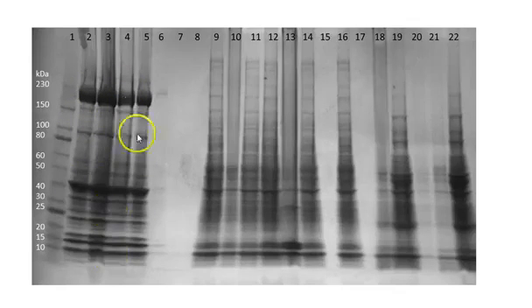As a matter of fact, the total diversity of proteins seems to be less in the heart than in here. There are so many proteins here in both the liver and here in this molecular weight that it becomes a solid gray because the bands run into each other.